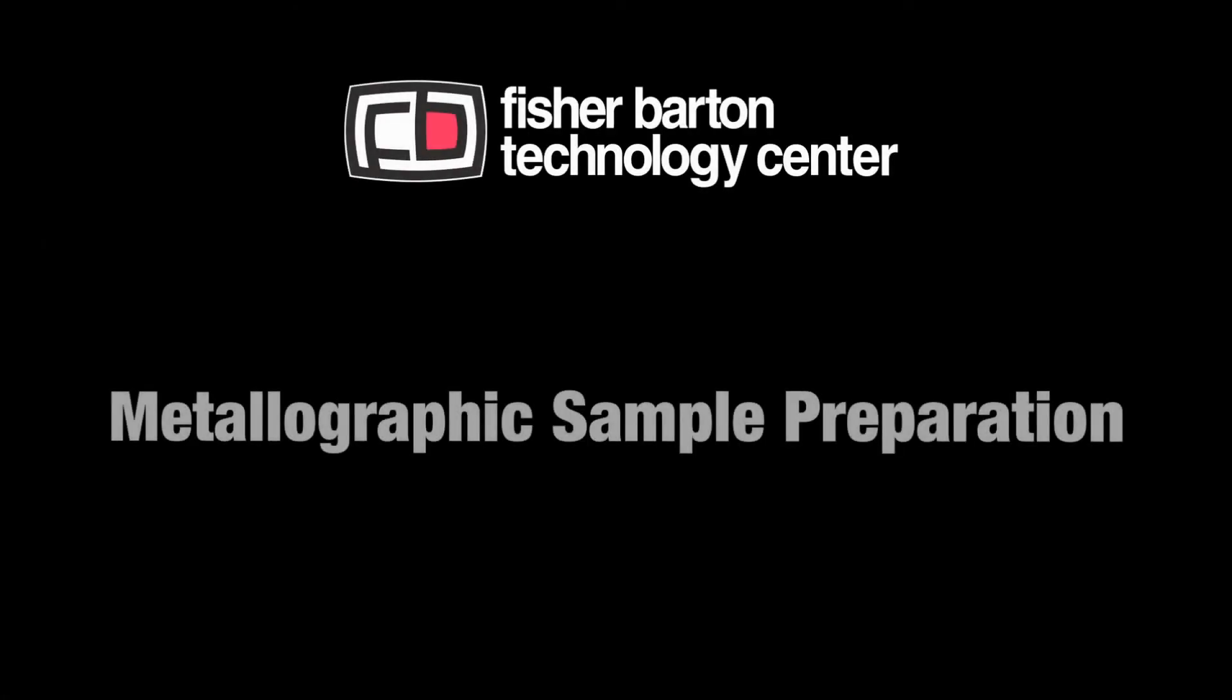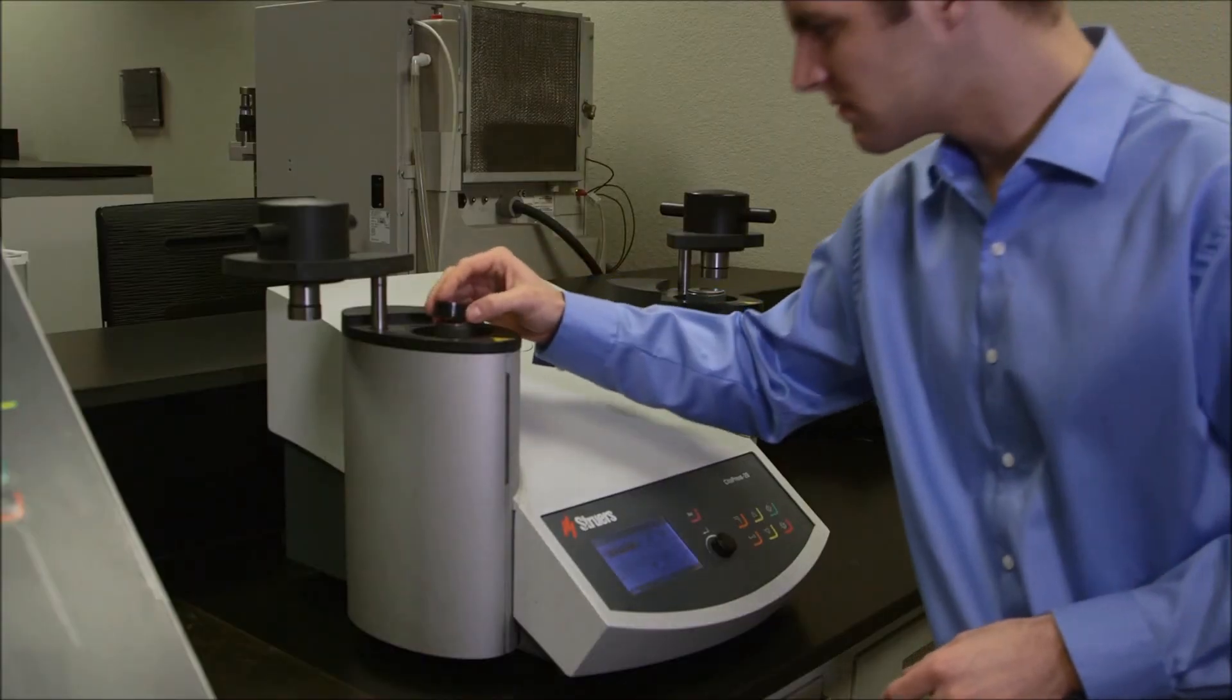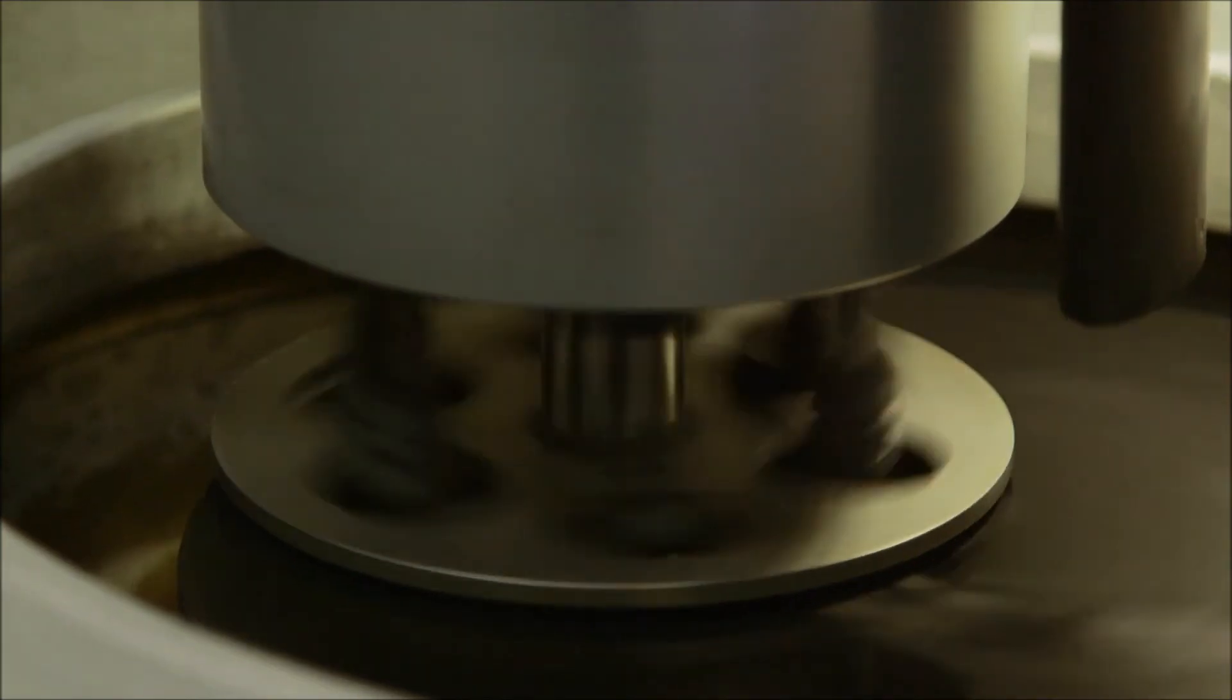A necessary component of materials testing is sample preparation and within our laboratory we have a sample preparation area that has an automatic cutoff saw an automatic mounting press and an automatic polisher for producing uniform and consistent samples each and every time.